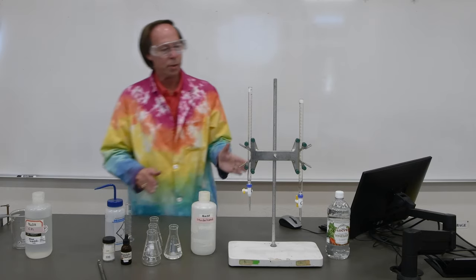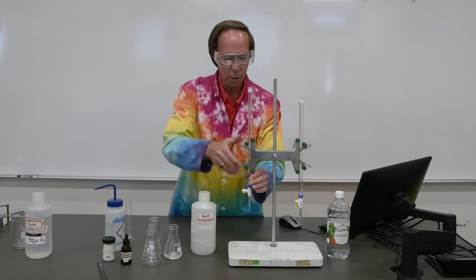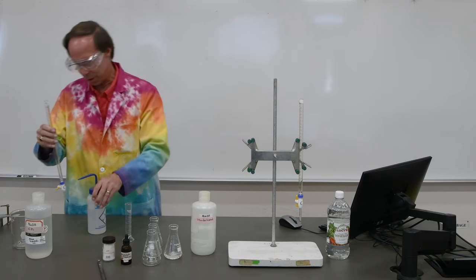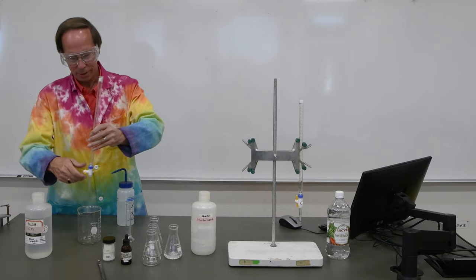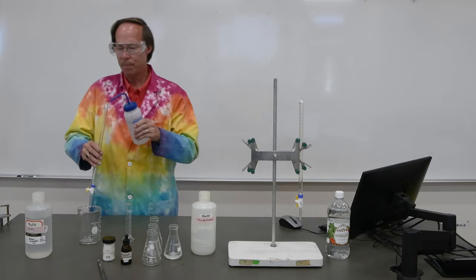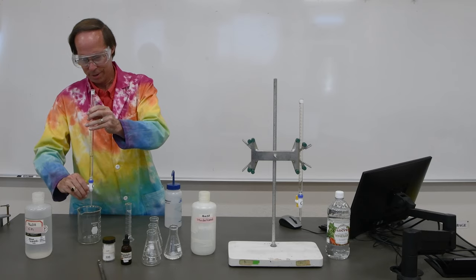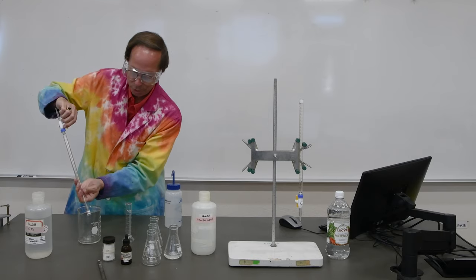And while that finishes dissolving, we can go ahead and prepare our first burette. This burette is the one that will contain our sodium hydroxide. So we're going to rinse it like we did in that previous titration lab. We'll use some deionized water to rinse out our burette a little bit. Let that drain through. We want to make sure if there's any contamination in here, we get rid of it. We'll do a couple of rinsings with the water. I'll swirl this around a bit to make sure we rinse the sides down. And now there should be nothing in our burette but deionized water.